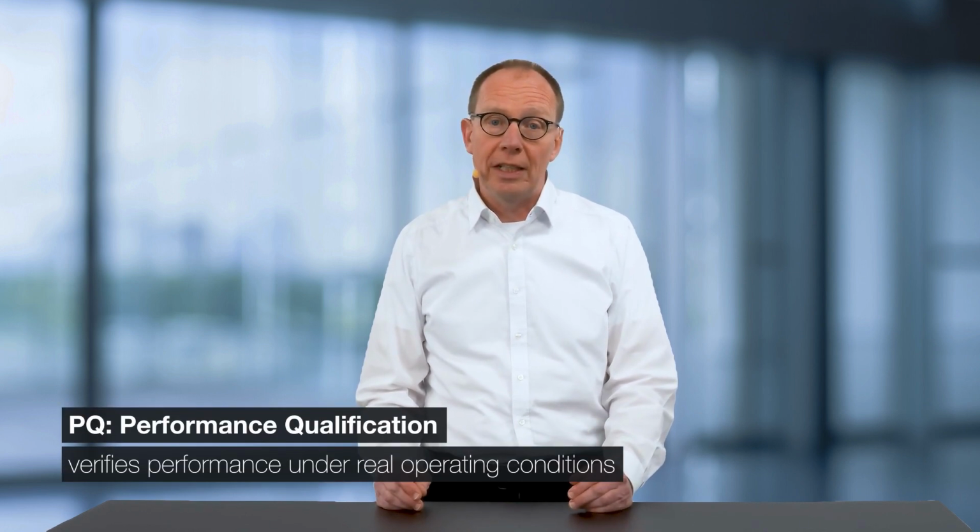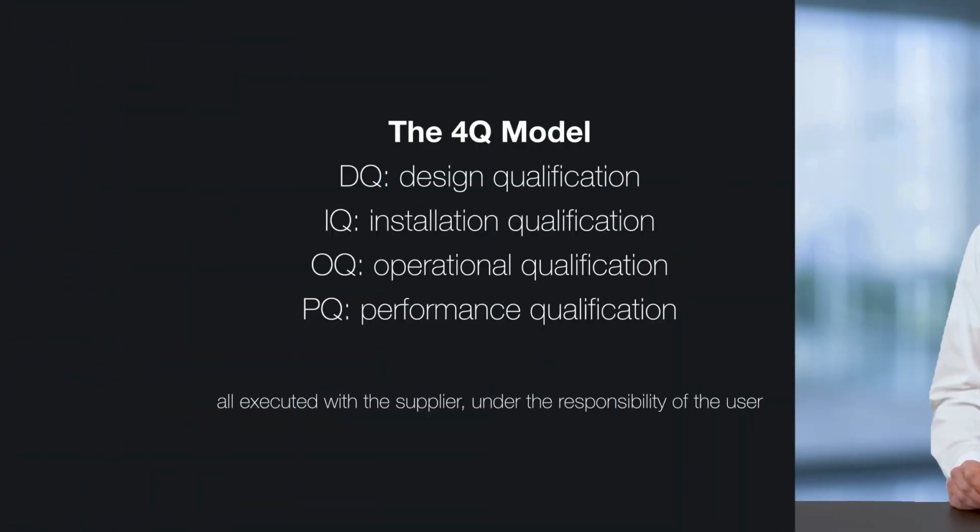The last part of the qualification process is the performance qualification, the PQ. Here, the documented demonstration is given that the instrument consistently performs under real operating conditions and with actual process materials. This qualification step must be done under the full responsibility of the instrument user.